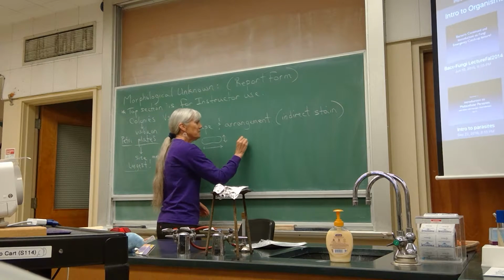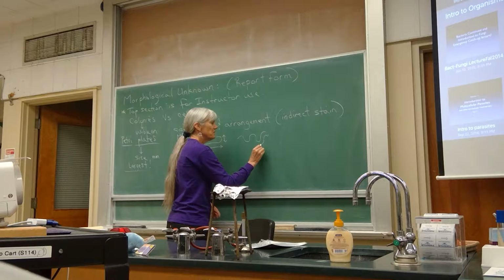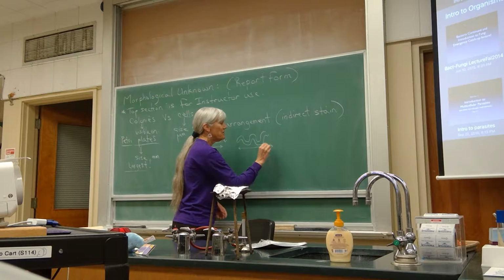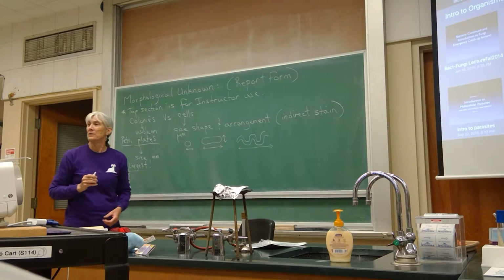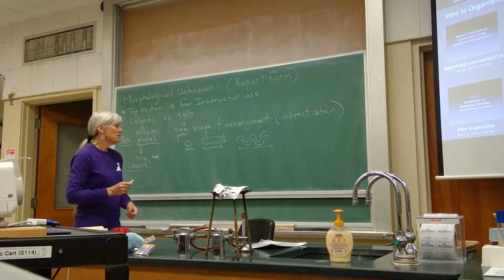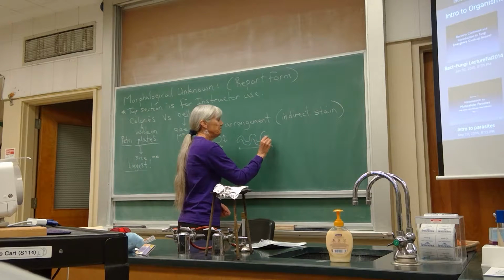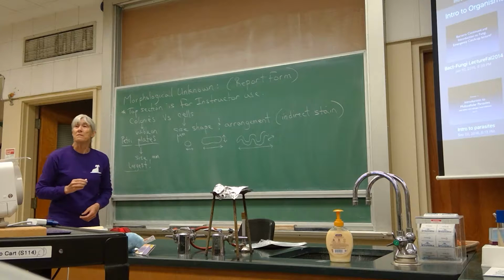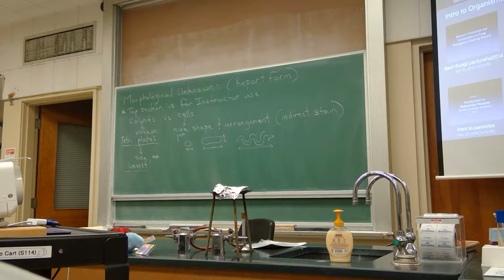If they are spirilla, we only have one of these, measure length without trying to figure out what they would be if you stretched them out. You know, like a spring, you don't do that to them, just measure length that way. But again, you have to measure diameter. And you should measure more than one cell. Think about if somebody asked you, how big are humans? We're not all the same. Big ones and little ones, fat ones and skinny ones. Measure more than one.